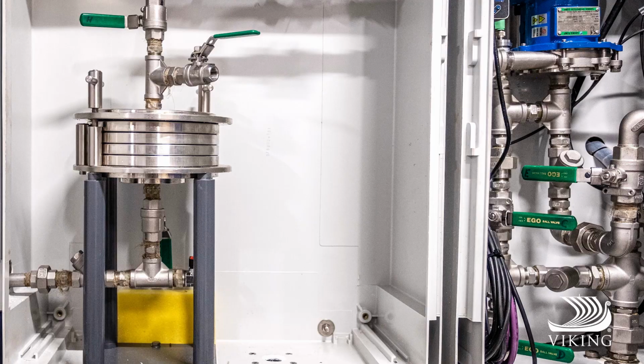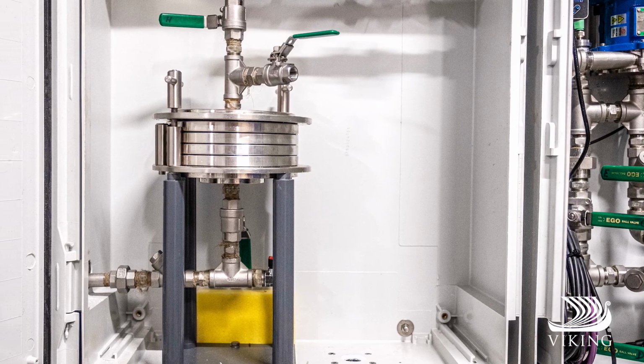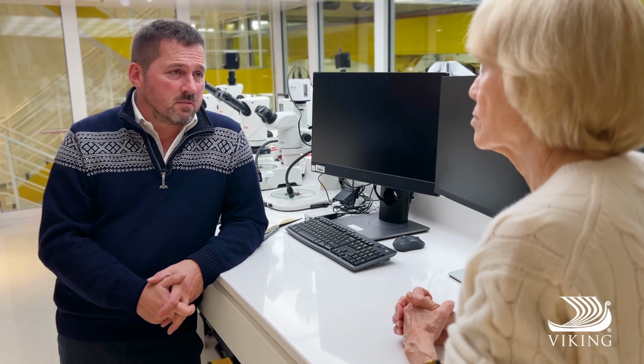But we were discovering very small blue fibres being seen. These samples were also being found in plankton samples taken maybe a kilometre or 2 away from the vessel using a totally different system. So we're reasonably sure that this is not an artefact of our presence. And very concerning.